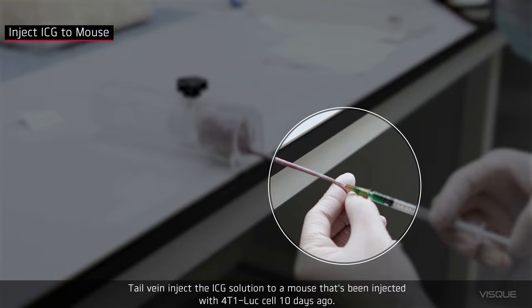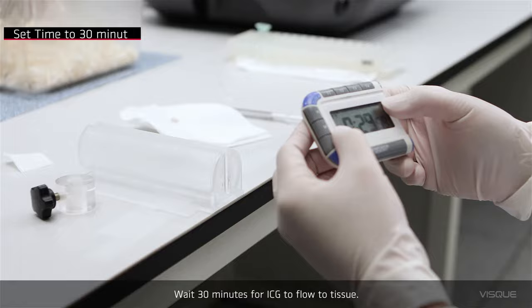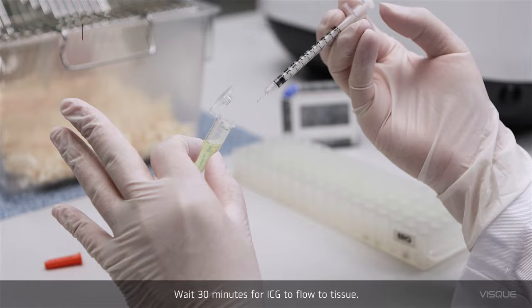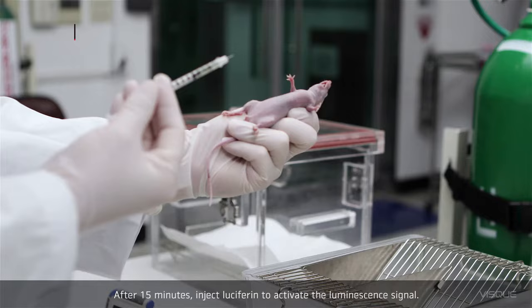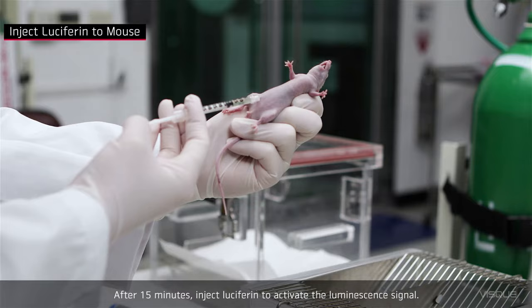Wait 30 minutes for ICG to flow to tissue. After 15 minutes, inject Luciferin to activate the luminescent signal.